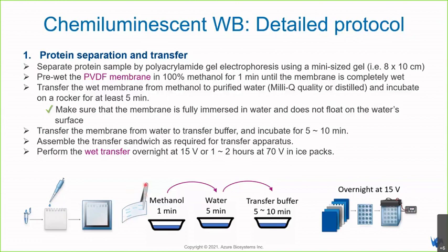For the PVDF membrane, pre-wet it in 100% methanol for 1 minute until the membrane is completely wet. Then transfer this wet membrane from the methanol tray to a tray filled with purified water.